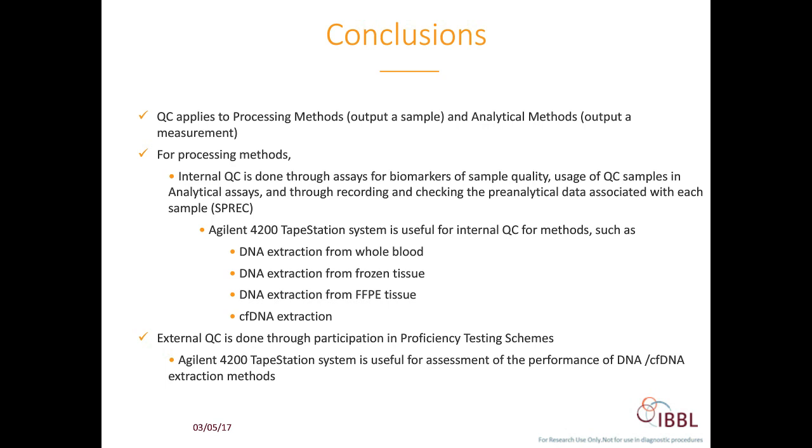External quality control is done through participation in proficiency testing schemes. And here again, we saw Agilent 4200 TapeStation system, how it is useful for assessment of the performance of genomic DNA and the cfDNA extraction methods.